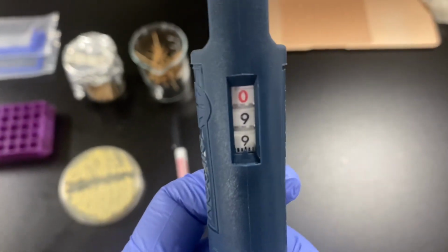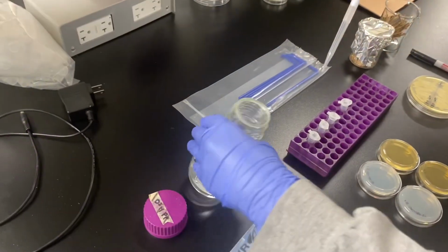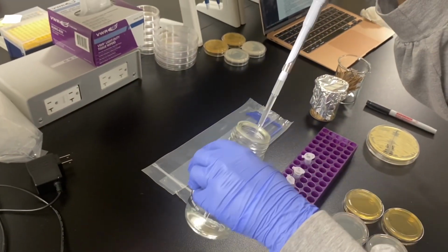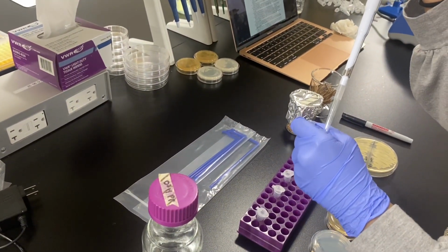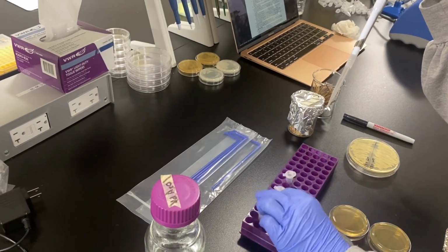Adjust the P1000 micropipette to 0.99. This will allow you to get 990 microliters of solution. Attach a fresh pipette tip and add 990 microliters of sterile water to tubes 2 and 4.